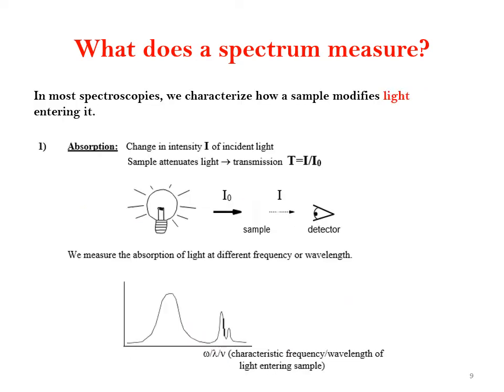So we have the absorption spectrum and the emission spectrum. The absorption spectrum is also called the excitation spectrum, because the light that is used can be absorbed in the molecule and can excite that molecule. In the excitation spectrum, the emission monochromator is set to some wavelength where the sample is known to emit radiation, and the excitation monochromator is scanned through different wavelengths.